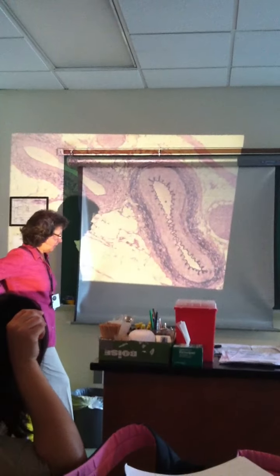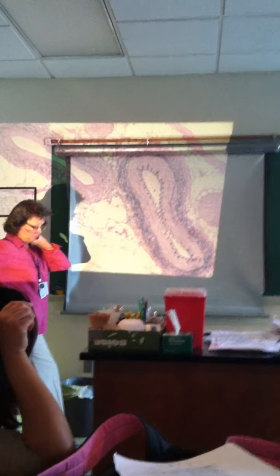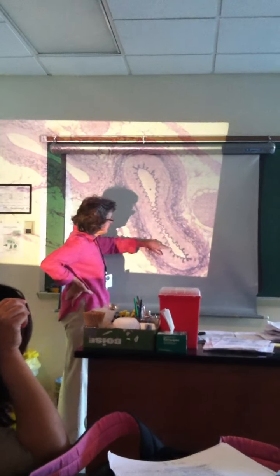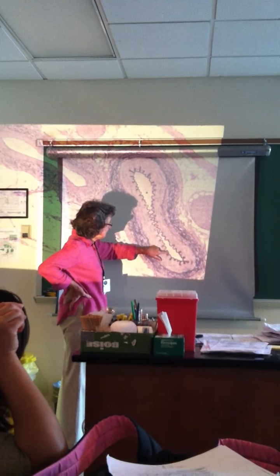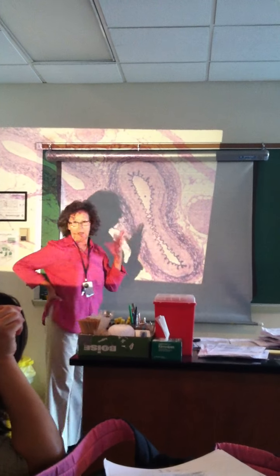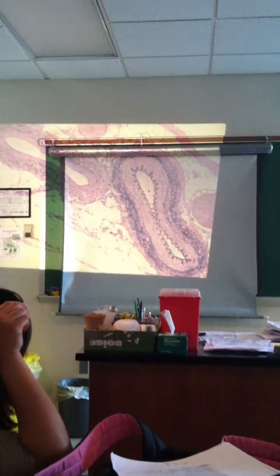Test, you do not have to know an artery from a vein or a nerve yet. You'll have to know that on your very last lab test. But you were looking at an artery slide, and you were looking along this basement membrane to see flat black nuclei in here. They don't show up very good here, but if you were at the microscope, which they're over there on display, it shows up nicely. So we have a couple of views of arteries here.